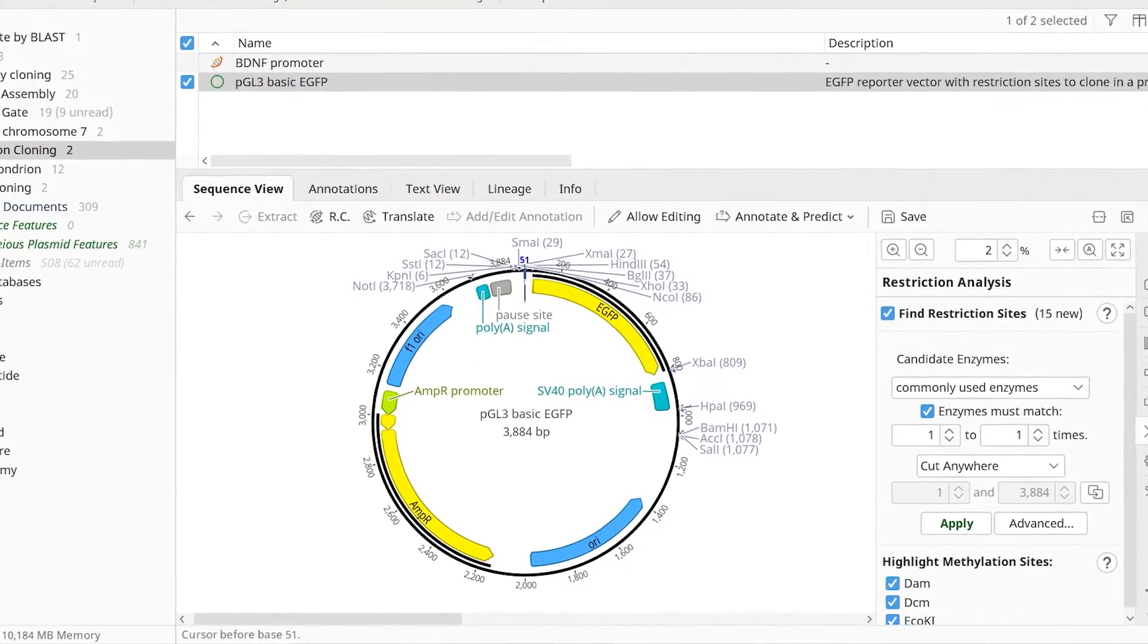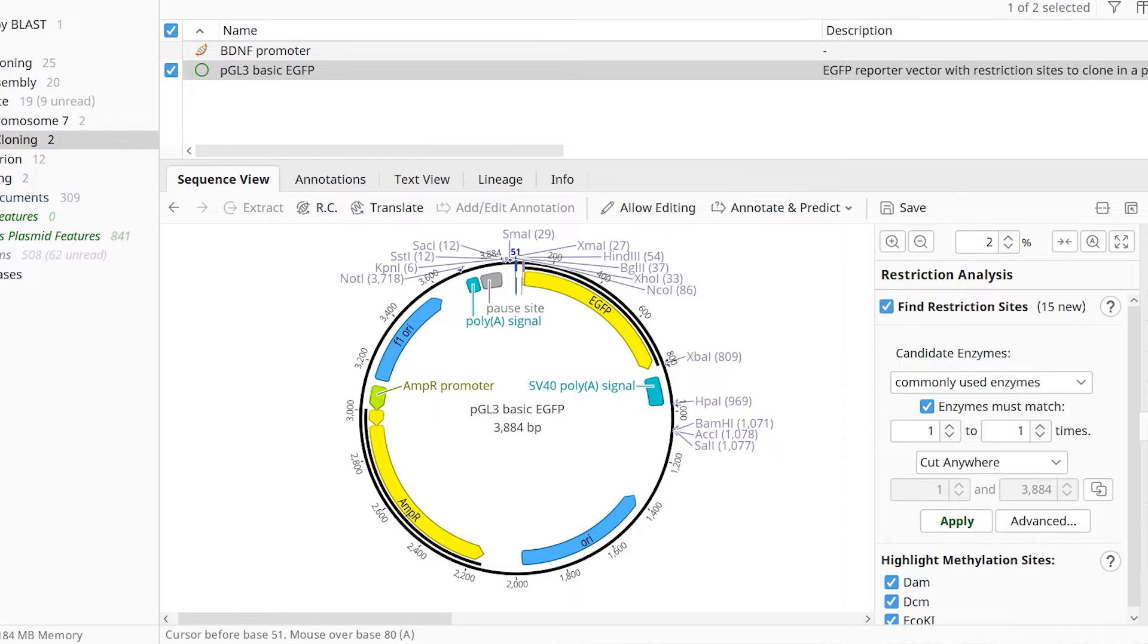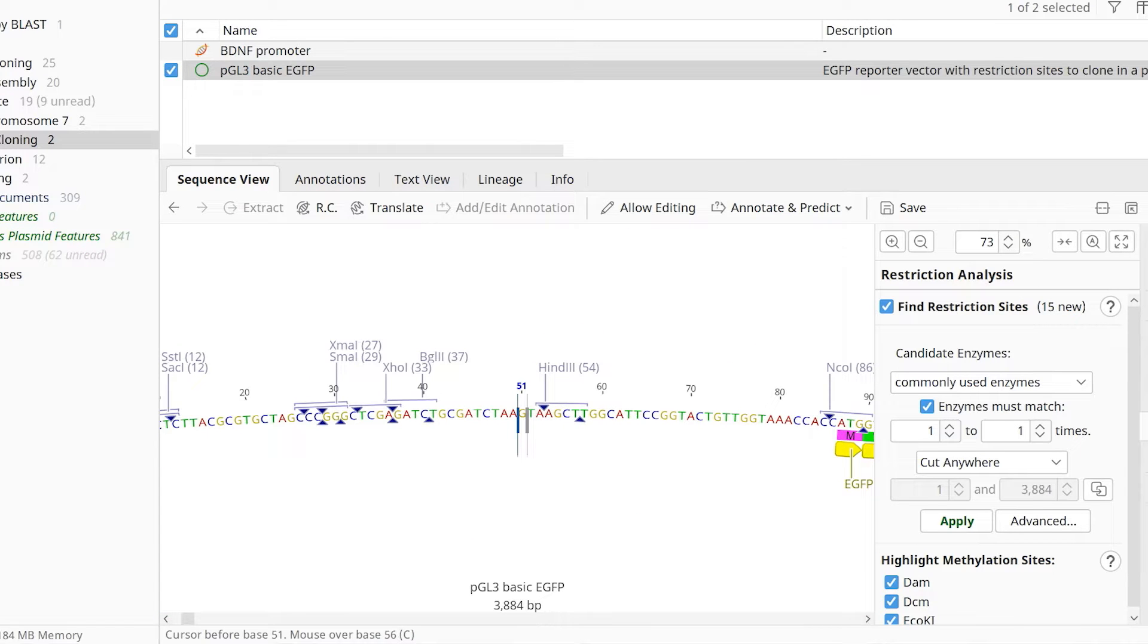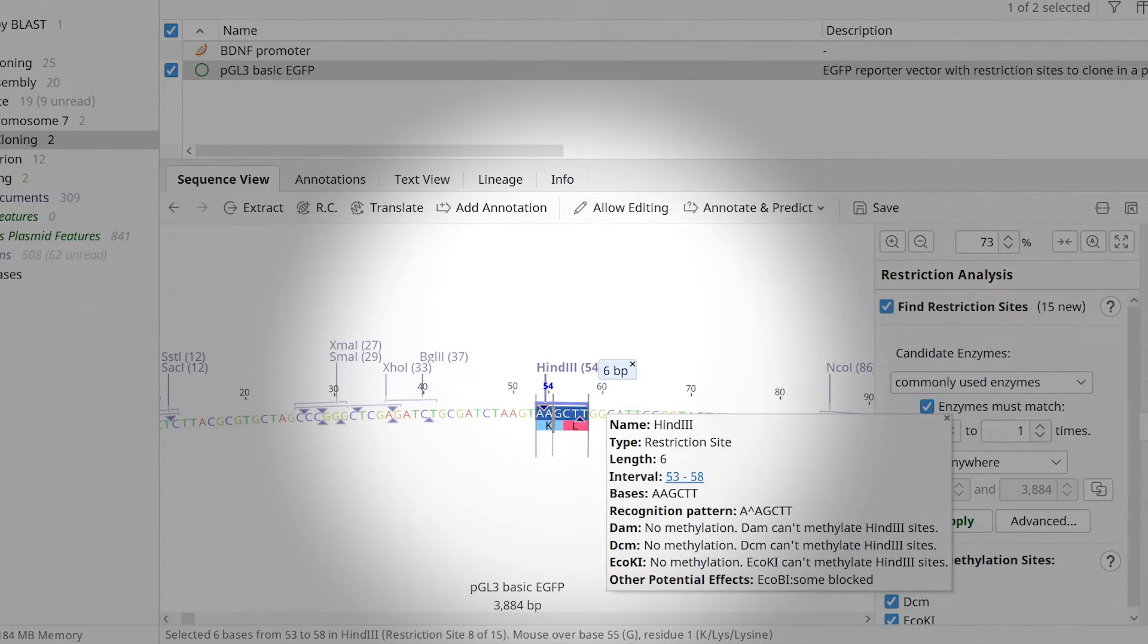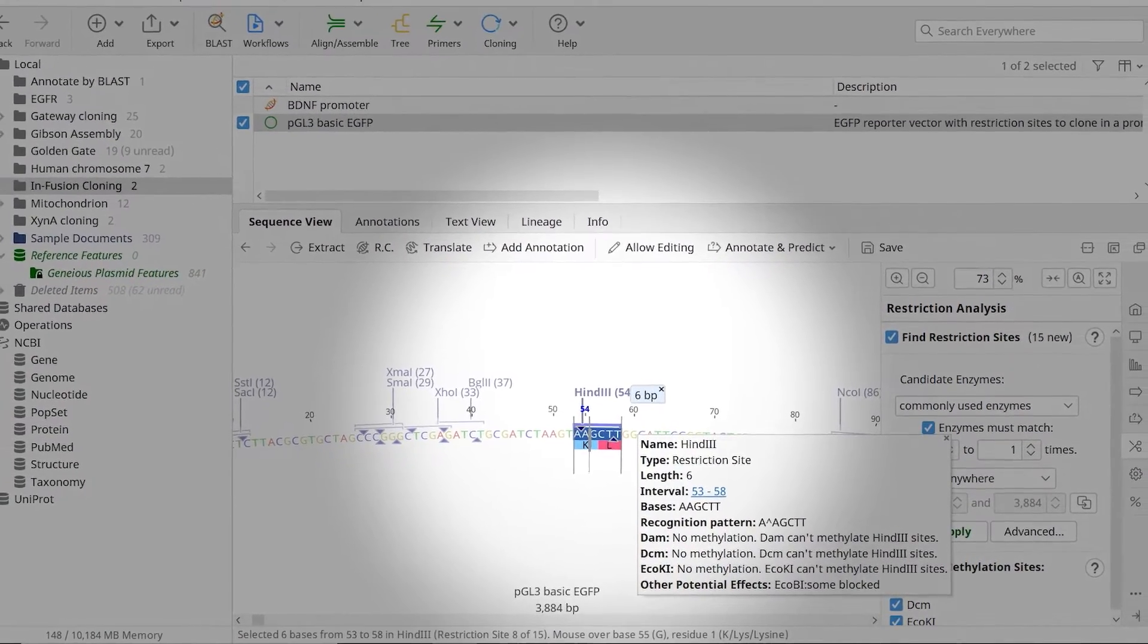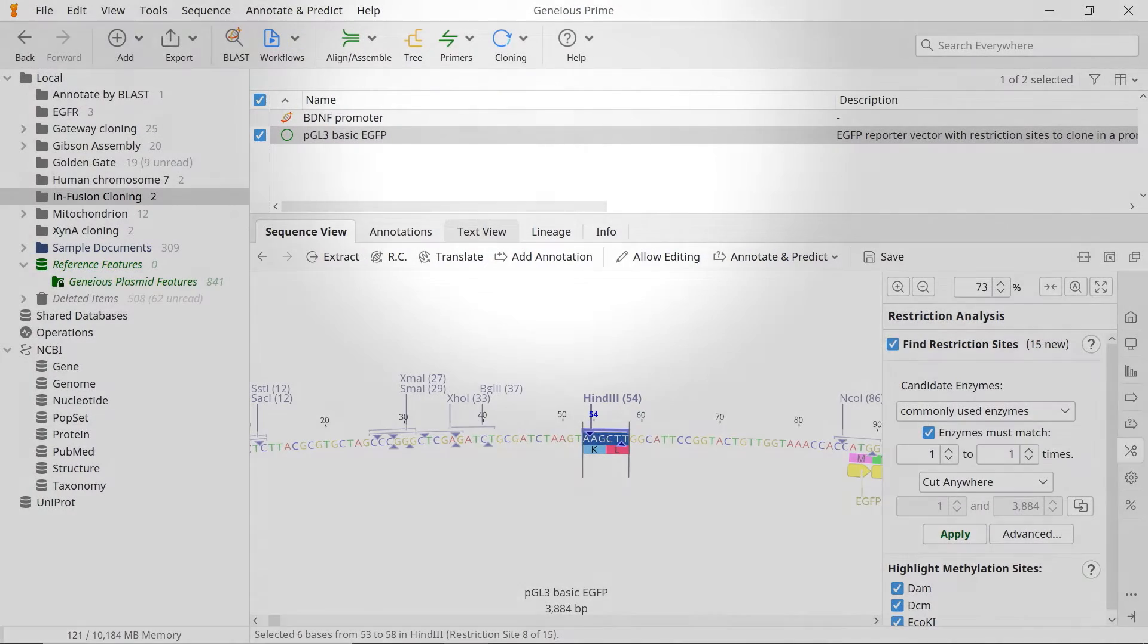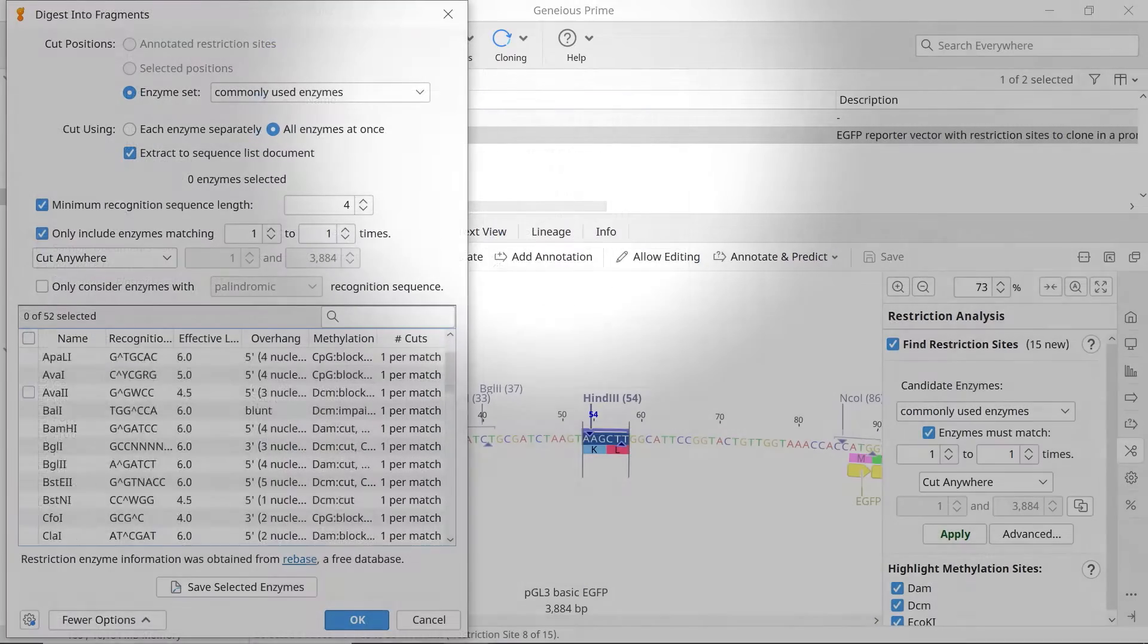To prepare a vector for infusion cloning, identify the region you want to linearise in the sequence. You can either use PCR or a restriction digestion to linearise the vector at the desired site. For the restriction digestion, select the unique restriction site. Then, select cloning at the top and choose the digest into fragments option.